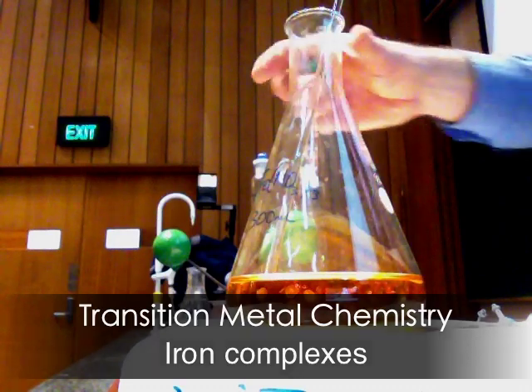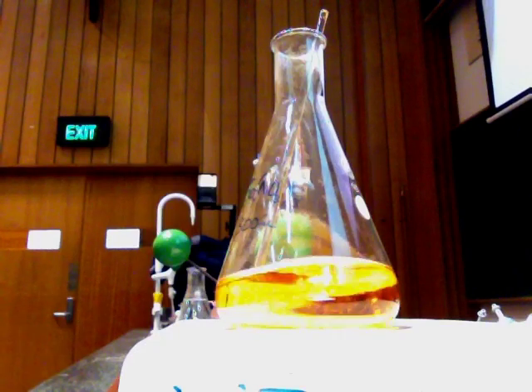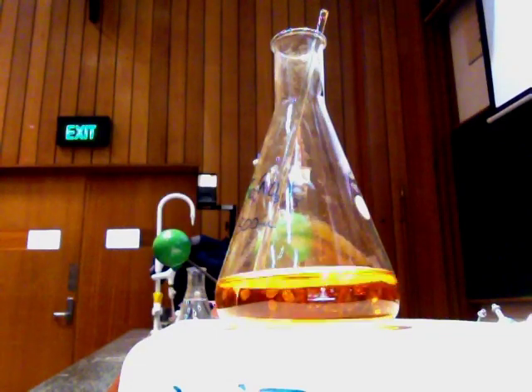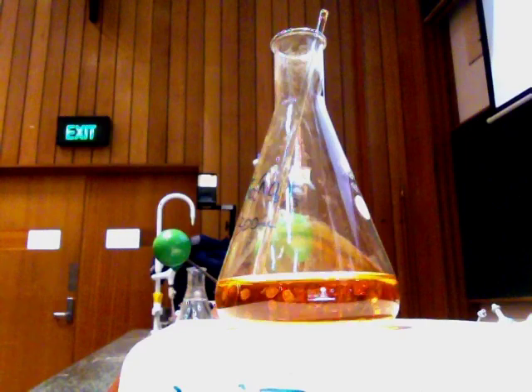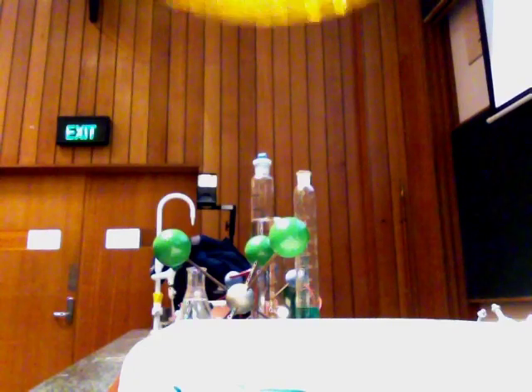I've got iron 3+ in my solution, and that's why it's got a kind of rusty brown colour. So this is iron 3+ in my solution.